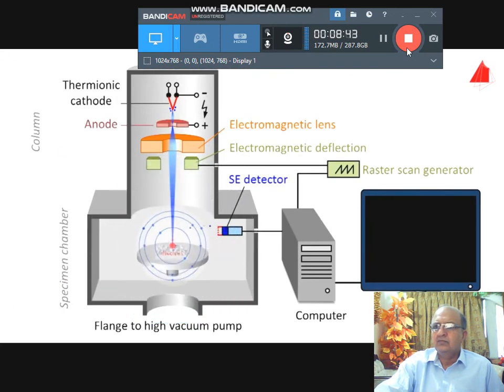So X-ray radiation is generated during the operation of the scanning electron microscope, namely X radiation, which is characteristic for the chemical elements present in the sample. If the energy and the intensity of the radiation are measured with an X-ray detector, then the chemical composition of the sample can be determined.